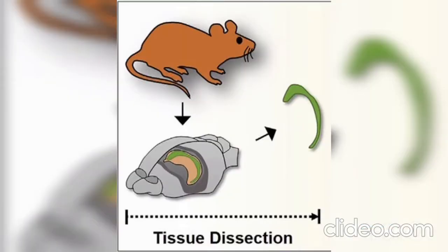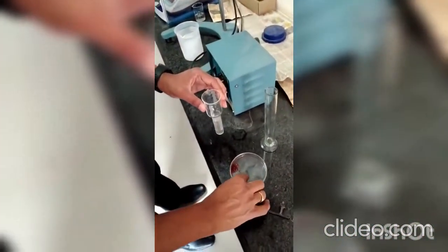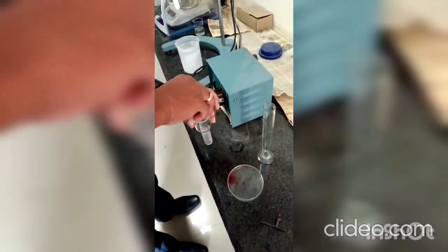Remove the organ or part from the animal carefully and cut into small pieces. With the help of forceps, put pieces one by one into a solution. A 1% solution is advised to be prepared in suitable buffer as per the protocol.